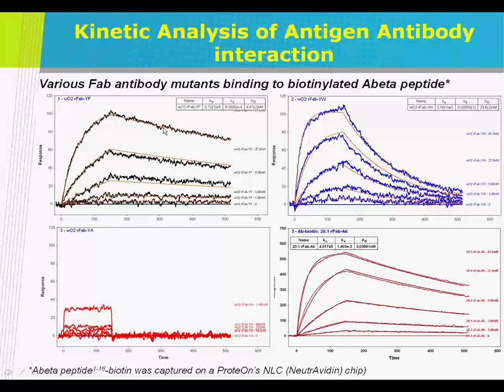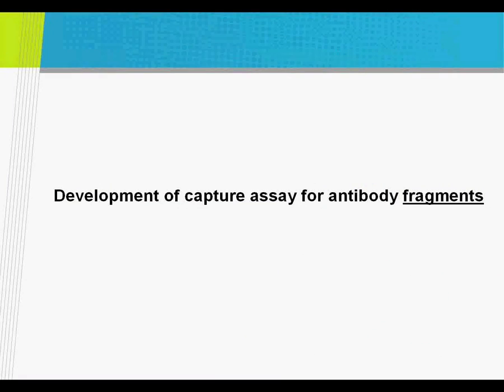Capture assays. People have used capture assays in these instruments for 15 years and have developed them mainly for monoclonal antibodies. And when I mean capture, some of you who may have done ELISAs, it's the same concept. Rather than immobilizing your antibody of interest directly, you capture them onto a suitable capturing agent.